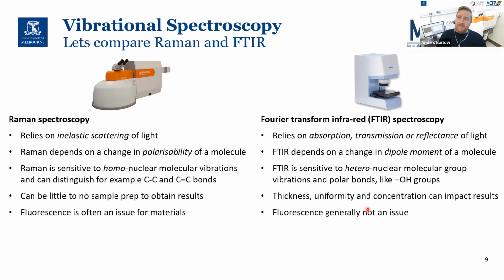In Raman, as many people will know, fluorescence is often an issue. Big broadband fluorescence will swamp the Raman signal because it is such a weak signal. With FTIR, that's generally not an issue.